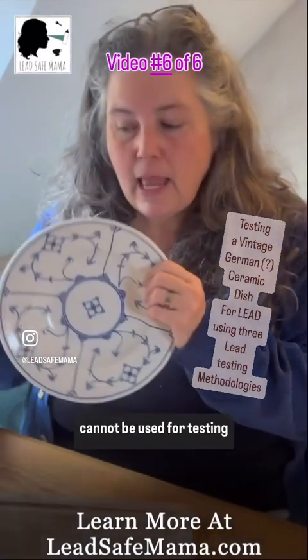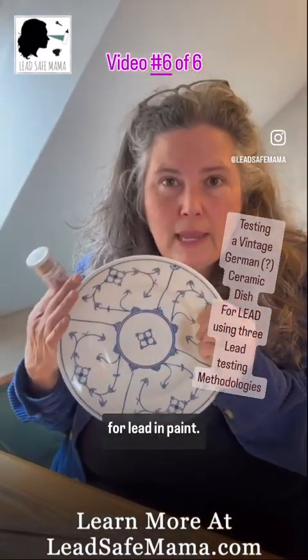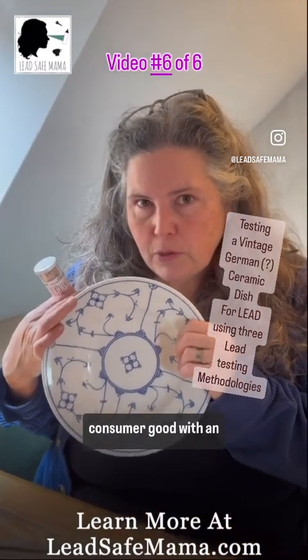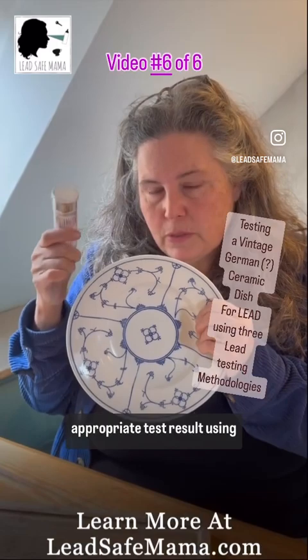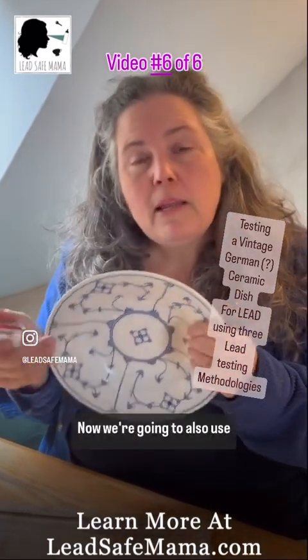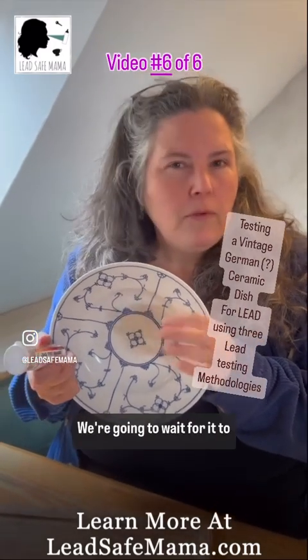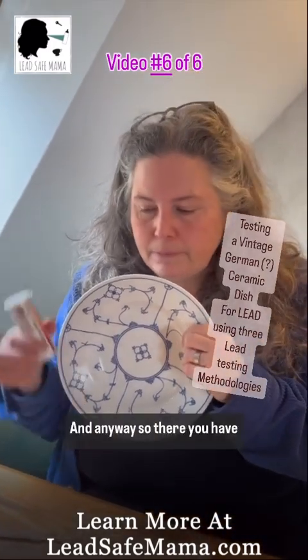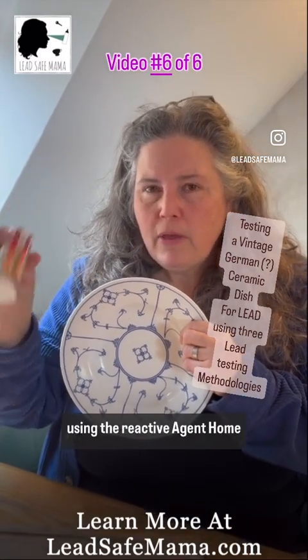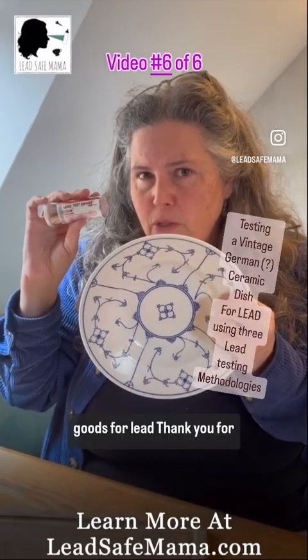So these test kits cannot be used for testing consumer goods. They're designed for testing for lead in paint, and we're seeing that across the board. So far we have not gotten a consumer good with an appropriate test result using this on several different types of consumer goods. Now we're also going to use the glowing test kit and see what kind of results we get. We're going to wait for it to be a little bit darker to do that.